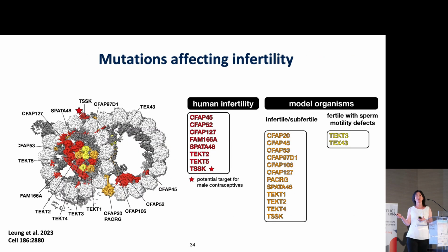So I do want to show you, because it is the health session, what do you actually get from having a structure like that? I think it is amazing and remarkable, because we are not just identifying proteins, we also put them in place. We really say where they are and with which proteins they interact, so the whole network. And then what we did, we looked at the literature with all these strange names of proteins, and we mapped them on our structure.